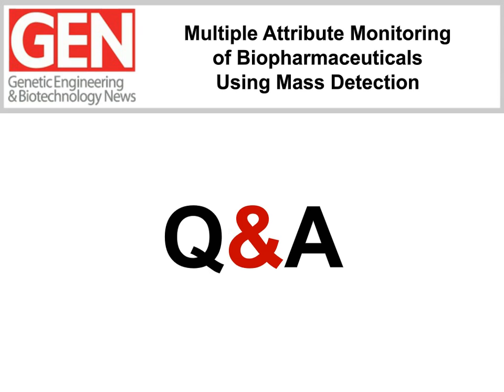So I guess the general answer is that it does not require you to use a QDA, but it opens the opportunity to use mass detection downstream of the higher-end characterization pieces, in which RapiFluor MS brings benefit as well. Okay, great. Thanks for that answer.